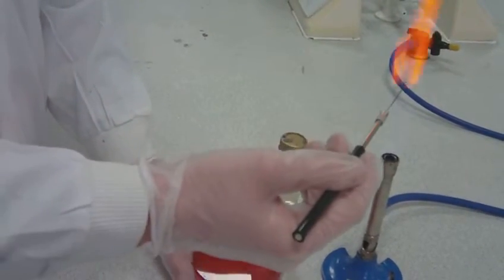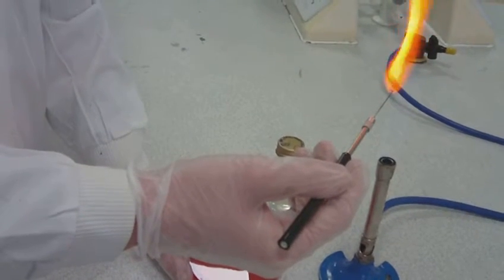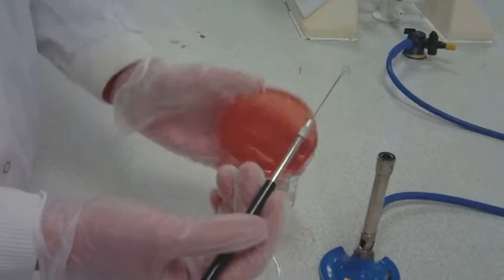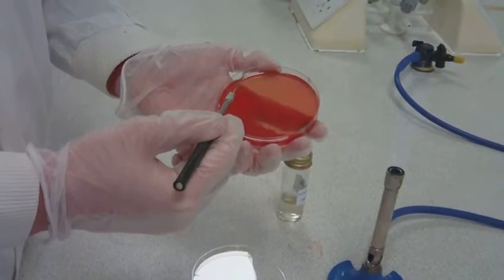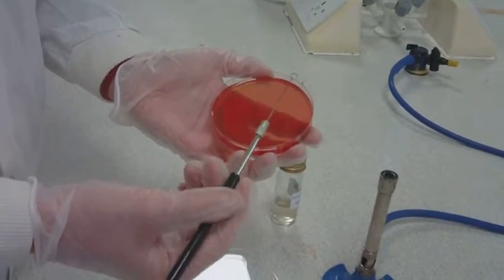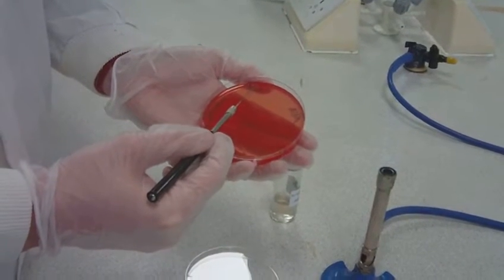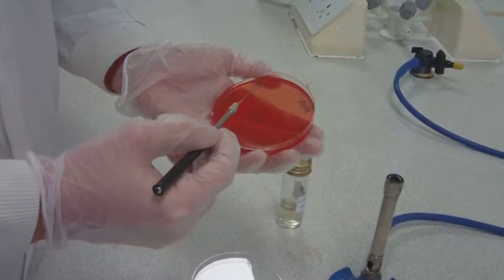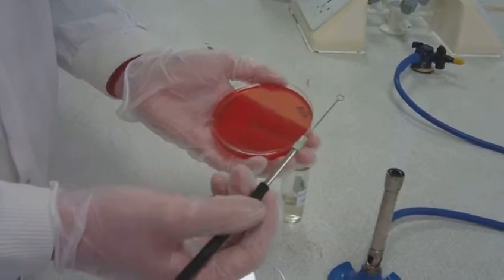Re-flame the loop and let it cool for 5 seconds by touching it to an unused part of the agar surface close to the edge of the plate. Use the loop to streak the bacteria across one quarter of the agar from the circle you just did in 3 to 4 lines going from 12 to 3 o'clock.